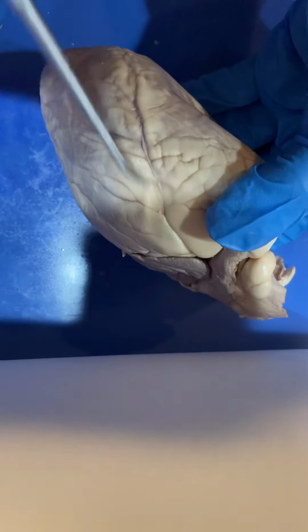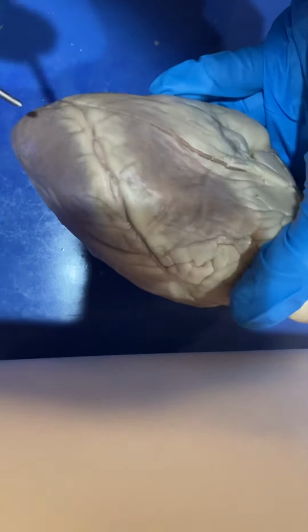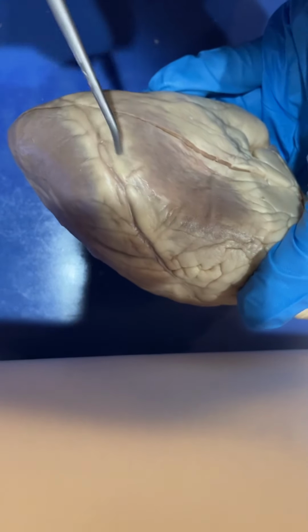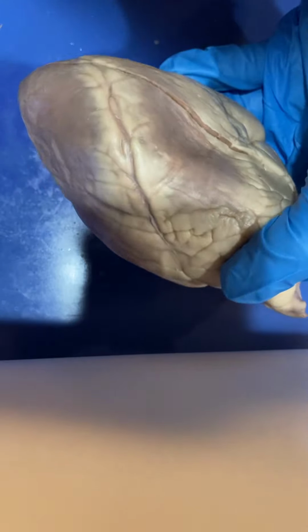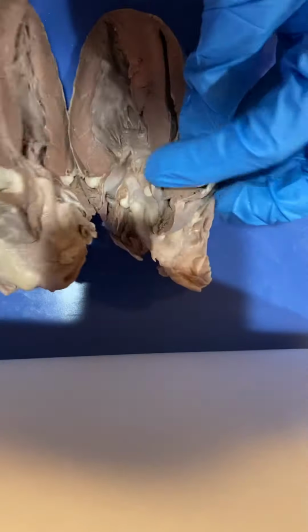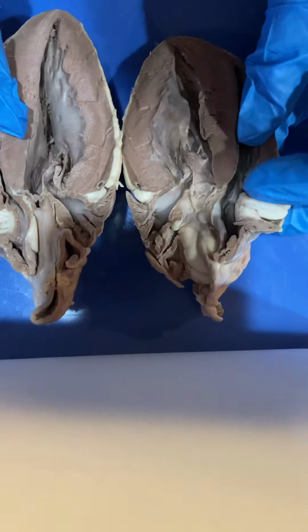Now this is going to be called the coronary artery. It's typically covered by a layer of fat that you'll see is one of the more drastic things that helps it stand out. So this is going to be the coronary artery. Now as you open it up, you're going to notice the inside features.